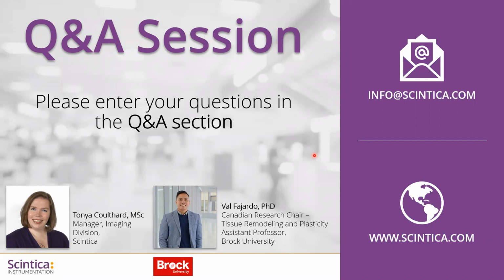Good question. Perfect. I had a question as you were talking about the cages. It was interesting to me that you had the NASA cage controls on Earth and then the vivarium cage controls on Earth. Was there suspected to be a difference between those, or was that just an extra control to make sure there was no effect of those cages? Just an extra control. We don't really ever expect a difference between ground control and vivarium control, but NASA wants to control everything, right? Which makes sense.